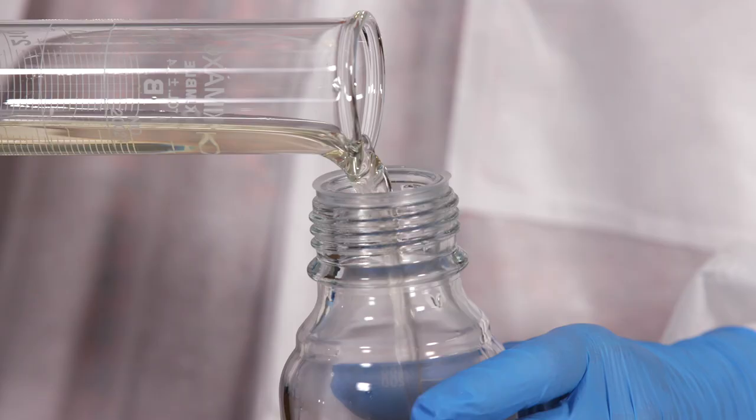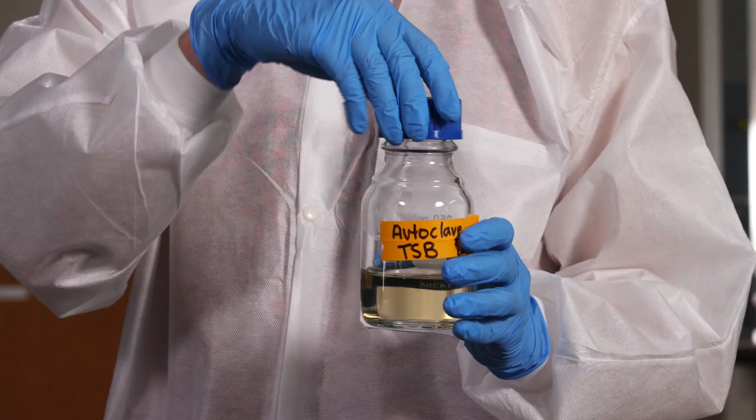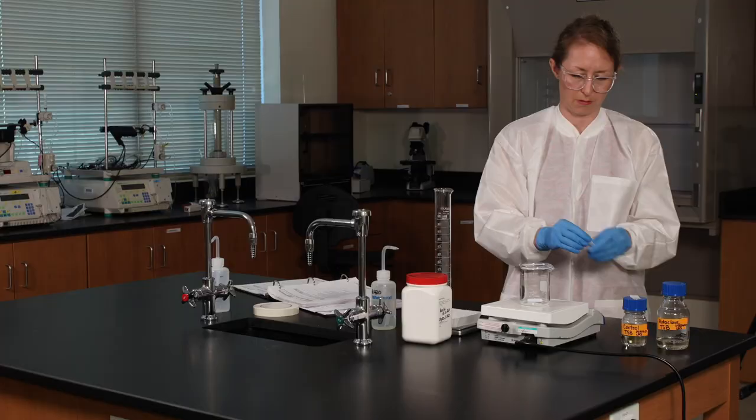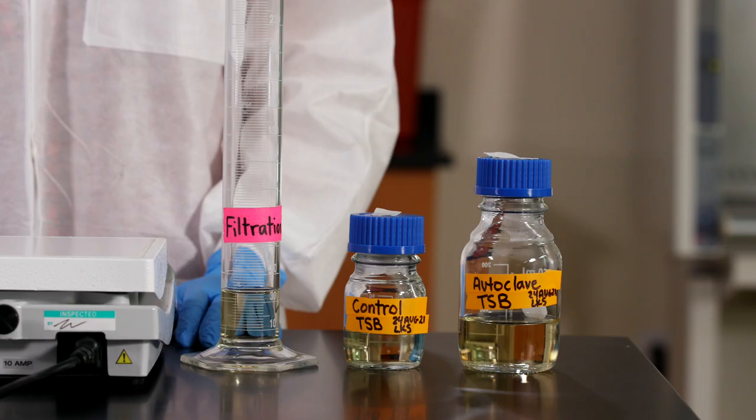Pour another 40 ml of broth into a second bottle, loosely cap it, and add a piece of autoclave tape. Label it autoclave.